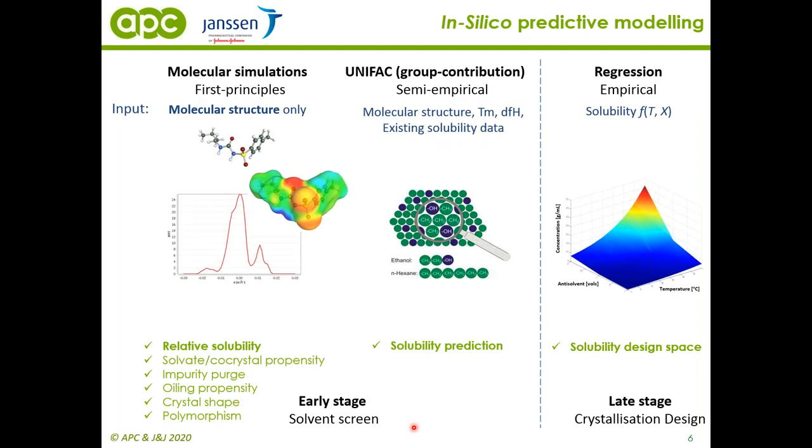And here, the quality by design principle we are basing on in silico modeling. So on this slide, I would like to tell you more about it. In the case of crystallization, of course, everything starts with the most important physical property, which is the solubility.